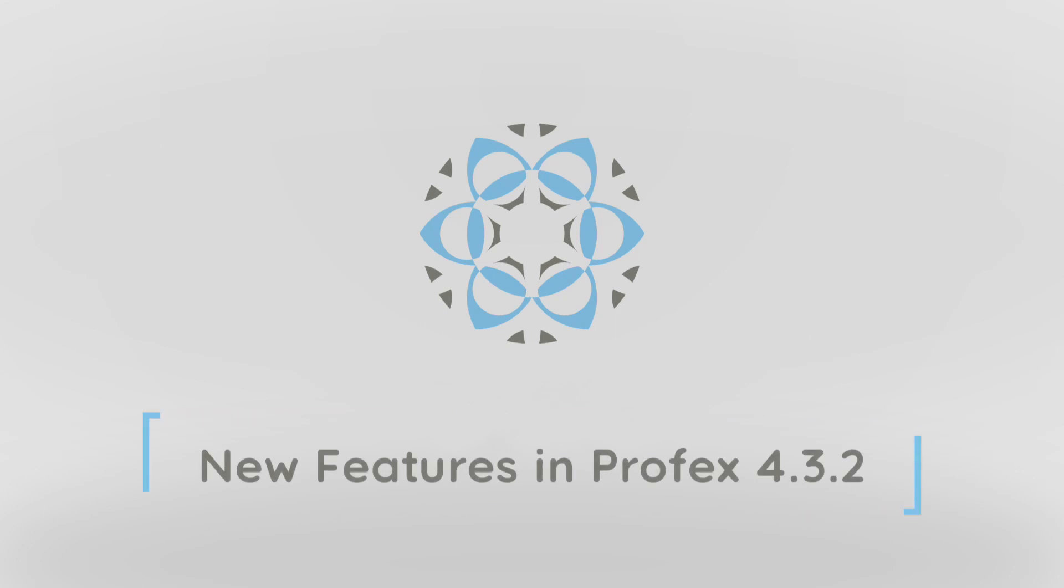Hi guys, I want to give you a quick overview of the new features in Profex 4.3.2, which was just released.